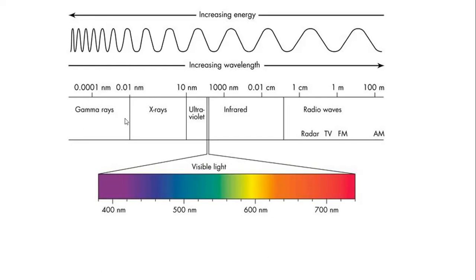So now if we are good till this point, then we develop this concept of how different energy light radiations are given out in response to certain events which happen within an atom or a molecule. Now, I gave you this understanding that when we are talking about absorption, the energy is transferred from the light radiation to the electron. And now the electron goes to the next electronic energy level.